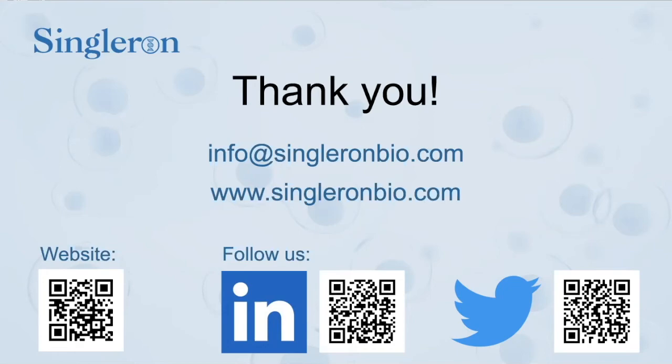The question is, is every UMI considered unique? Yes. Of course, the caveat of using UMIs is that you have to use enough UMIs that you are sure that each UMI is going to tag one transcript. That's why they are increasing in length. If you have 6, you can calculate, and not every UMI is a hit, right?